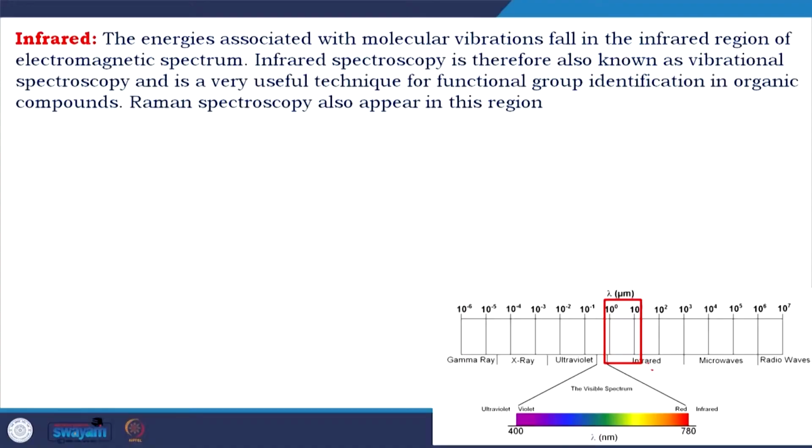They are affecting a single molecule in different ways. So, combining infrared spectroscopy and Raman spectroscopy would always give us more information, and in the later part of this module we will discuss this in detail. So, this is the infrared region.